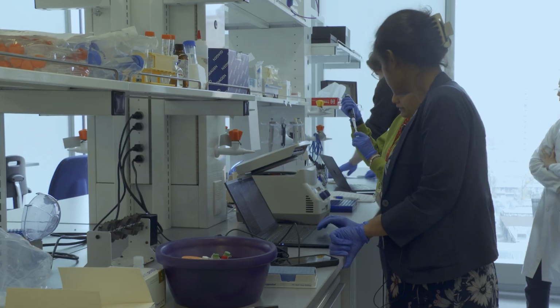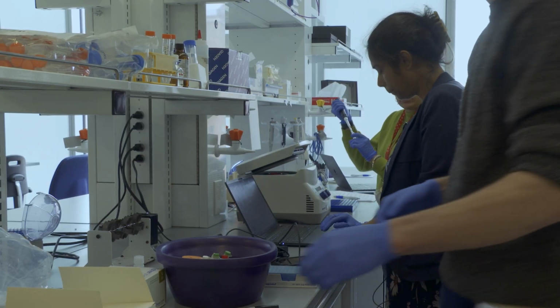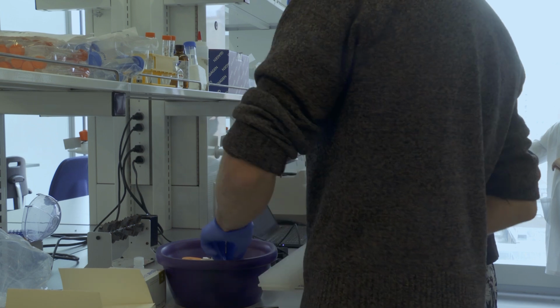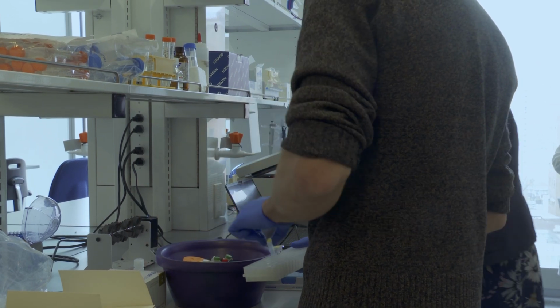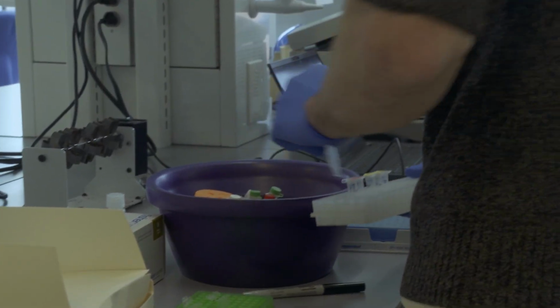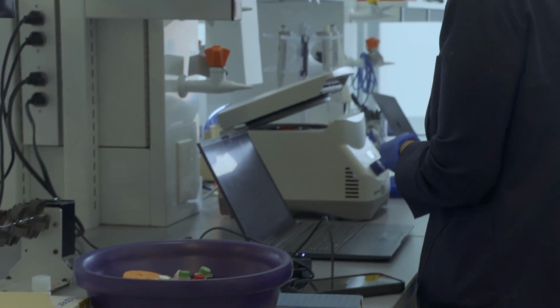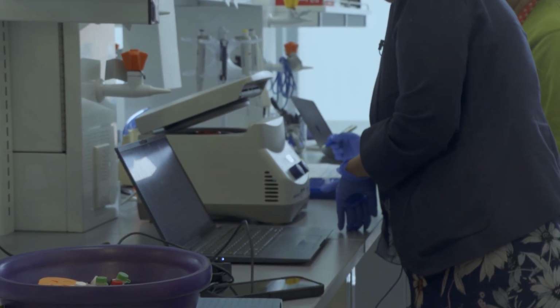Can I at least spin it? I know this is enzyme, you're not supposed to vortex it. You don't need to spin it down. Please add all the samples.